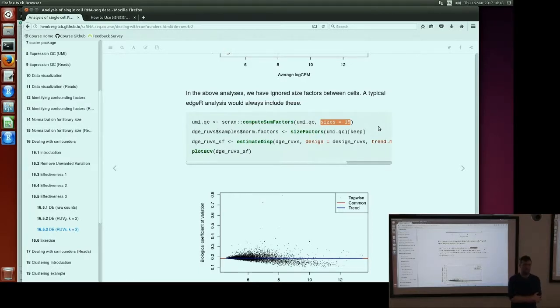Can you tell me what the better methods are for finding them? Well, these two could describe the methods that, for example, SC3 uses, and I'll let Martin discuss that. So it actually depends quite a lot on what your situation is, and we've developed two different types of methods. One is part of the clustering method that Vlad developed, which looks for the genes that are the most unique to each group of cells, after having identified the groups of cells.